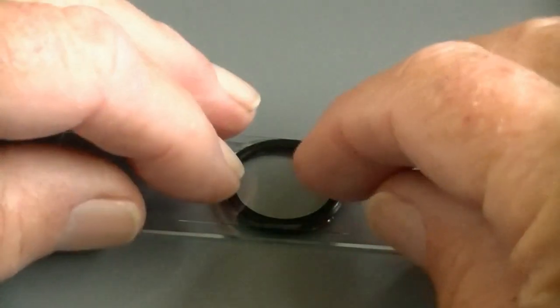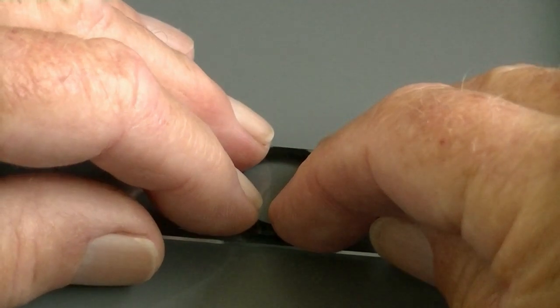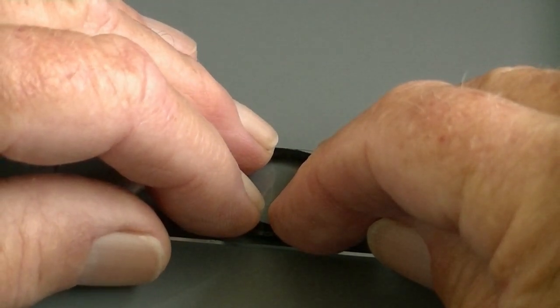And then apply gentle pressure to make a good contact between the cover slip, the slide, and the O-ring.